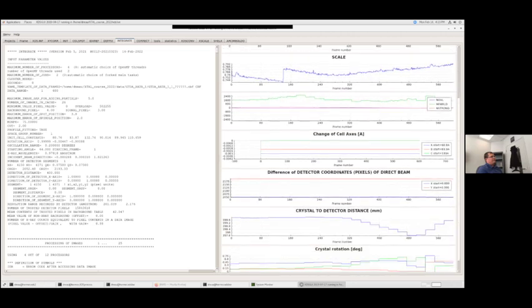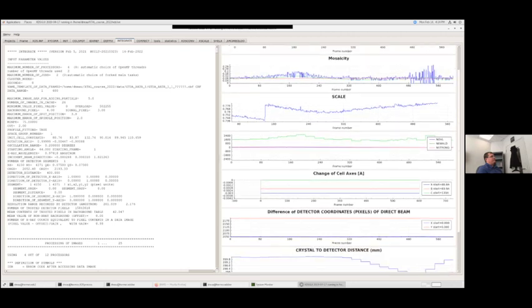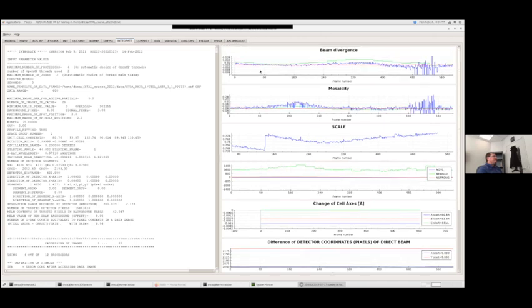I use the scroll wheel, and all of a sudden one of my scales goes really wonky. That's why. So be careful of that. You want to actually scroll the window, so make sure you're on the scroll bar. And the thing on these graphs, what you're looking for is small relative changes and no big oscillation swings.